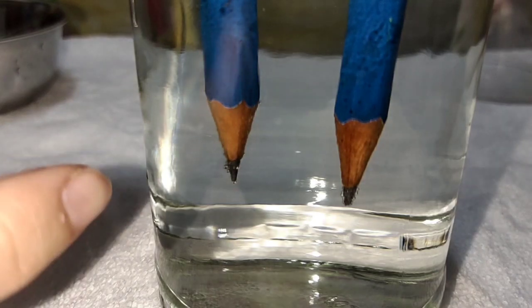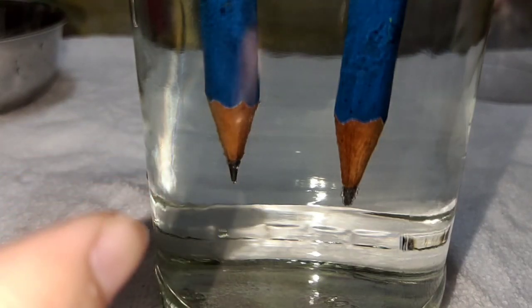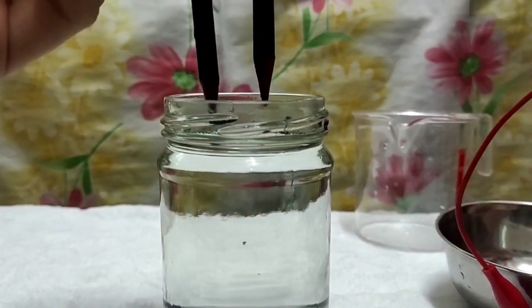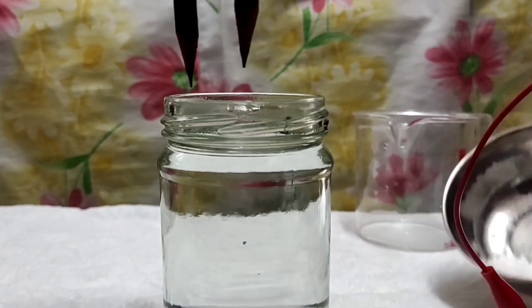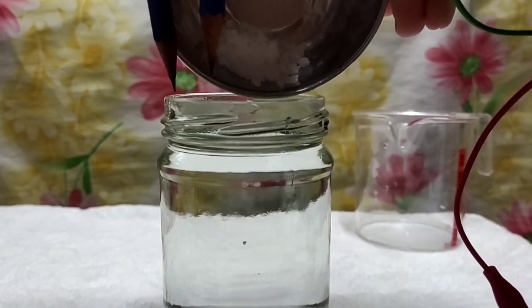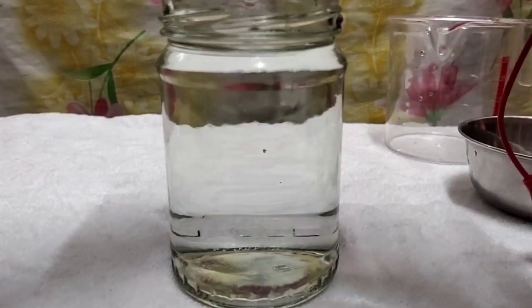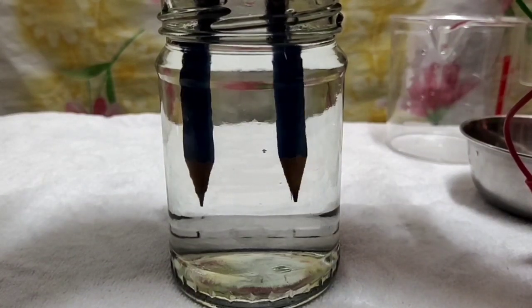The gas present at the cathode is hydrogen gas, and the gas produced at the anode is oxygen gas. So now I'll add some NaCl salt into this warm water and observe for 5 minutes more. After stirring and making sure that the salt is fully dissolved, I will now place back the electrodes and observe for another 5 minutes.